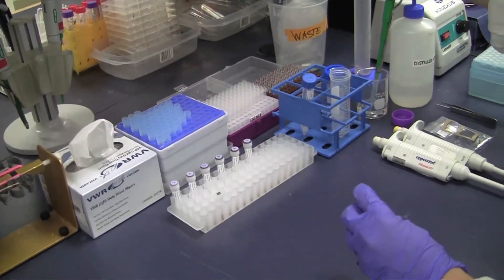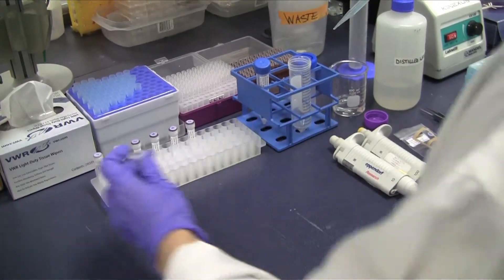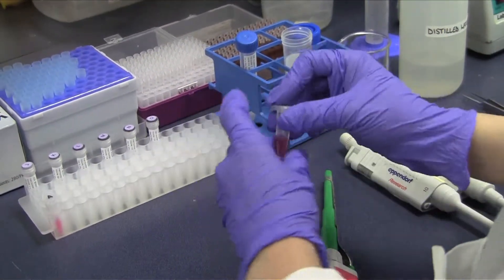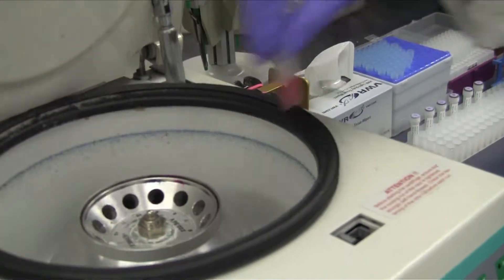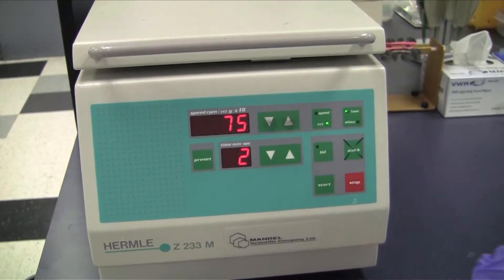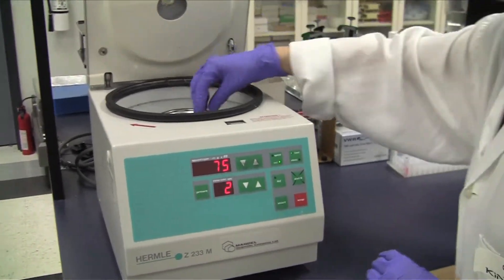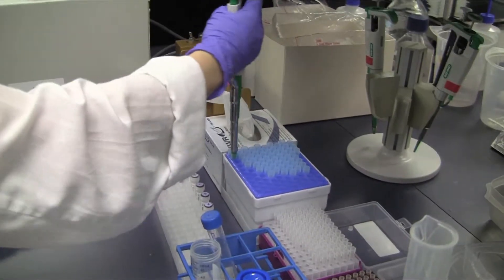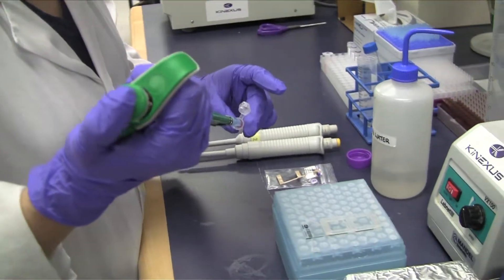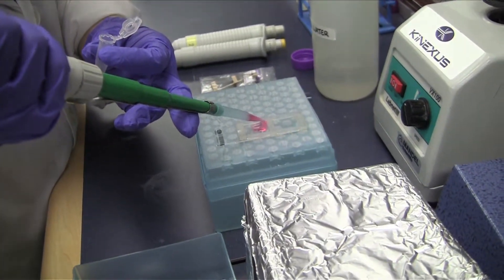Dilute the purified labelled protein lysate in incubation buffer to a final volume of 400 microliters. Load the protein lysates into their respective incubation fields and make sure the liquid in the well spreads out evenly to cover the array surface.